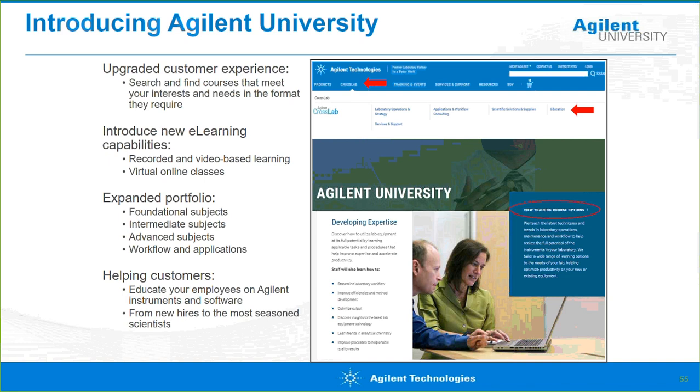I highly recommend either diving into this yourself or having super users within your company or your lab be involved in this, right? And so then you create super users that can be specific learners on different parts, and then they can go and train some more people, maybe new hires, interns, things like that within your lab, because these labs change over time. So this is a very useful way to keep updated within your lab.